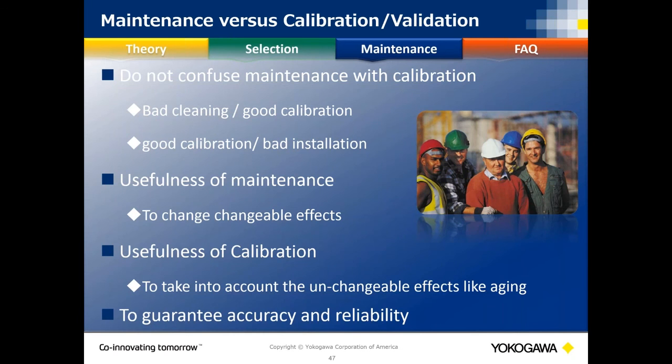Everybody knows that there's a difference between calibration and maintenance, right? Sometimes calibration is done just because the sensor's not working, but in actuality, you may not need calibration, you may just need to clean it. So we're going to go over what we suggest as the best practice.